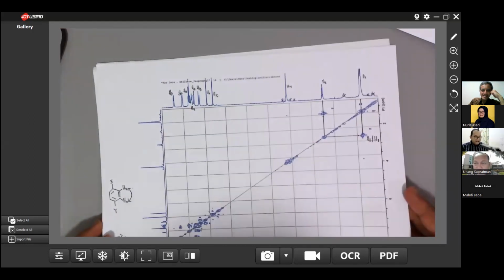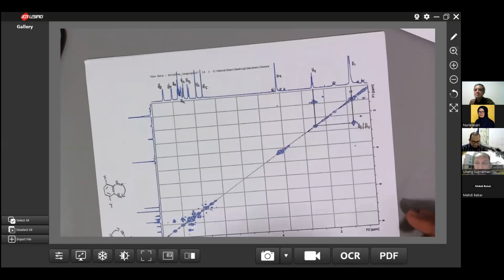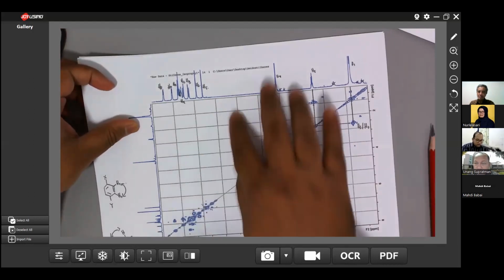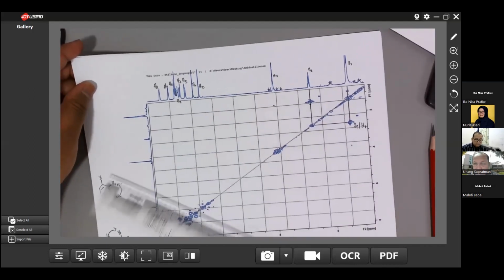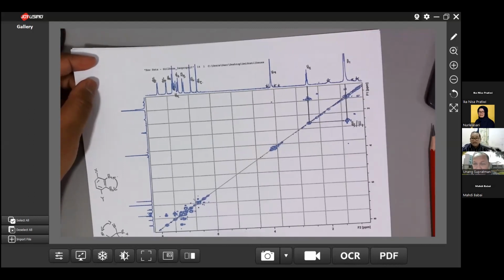So this is a very nice and very beautiful course. What you can do, actually there is no this kind of grid, but I set it up in the software. Sometimes it will help you to analyze the samples.